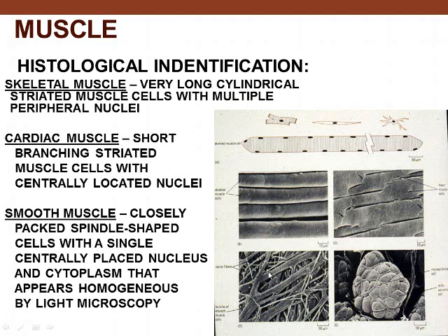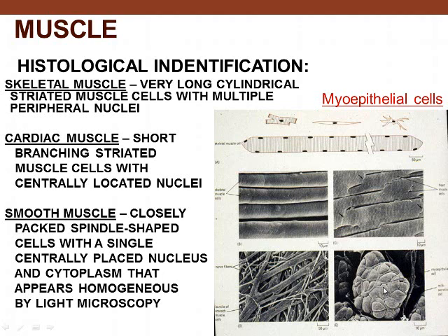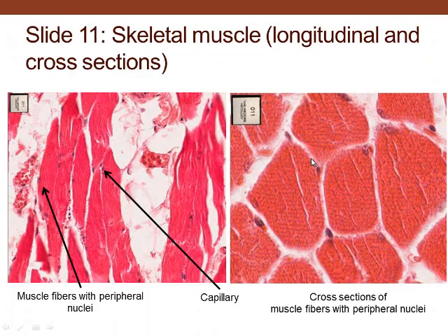Another type of cell is myoepithelial cells. Here we see myoepithelium that would surround a sweat gland to cause secretions to occur — it forms a little basket or net around it that squeezes down. We also have myoepithelium in the dilator muscle of the iris.